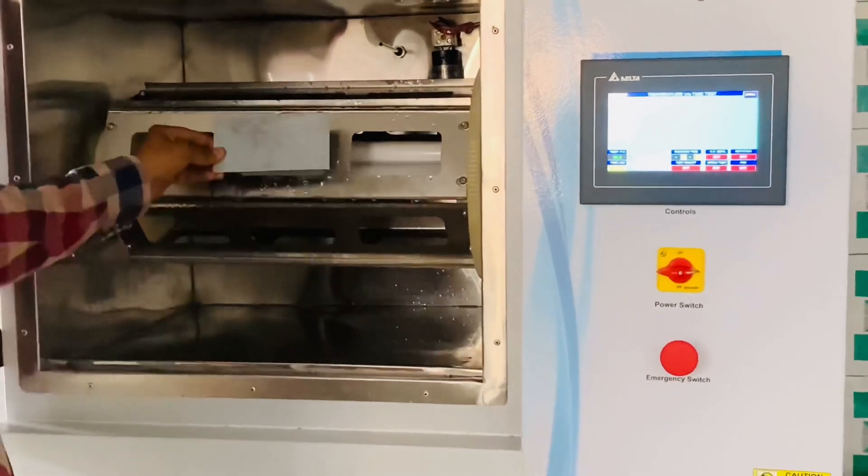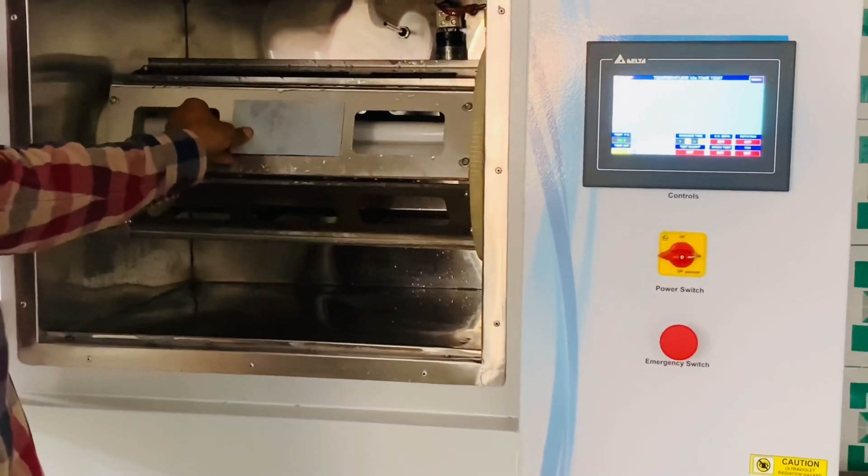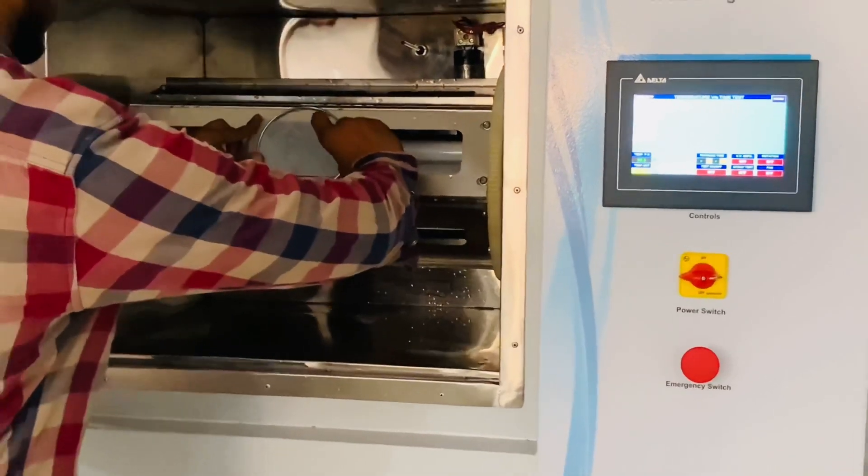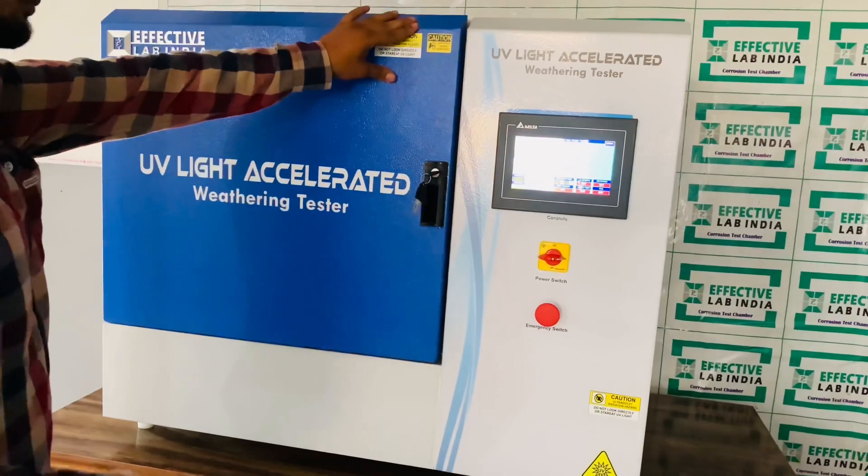Place the test panel on the rack with the test surface facing the lamp and fix it with the tension ring. Close the front door.